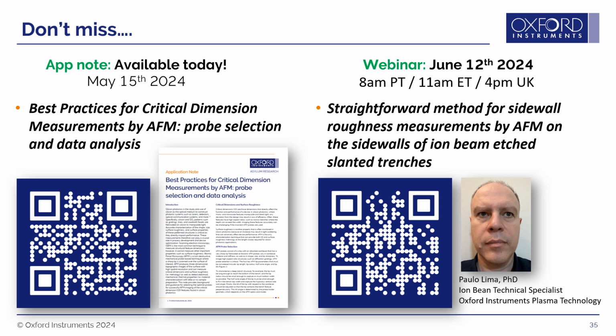Okay, great. So you suggested Jupiter for these measurements, but is there any reason I couldn't use my Cypher? So I could take that one. We've focused on Jupiter here because, as Marta just mentioned, many of these samples are fabricated at the wafer level. So sometimes it's a big advantage to be able to look at them while they're still in that form, or maybe still cut into relatively large coupons. That said, certainly with Cypher, if you're willing to cut down your sample to fit on a small sample AFM like a Cypher, it'll work as well.